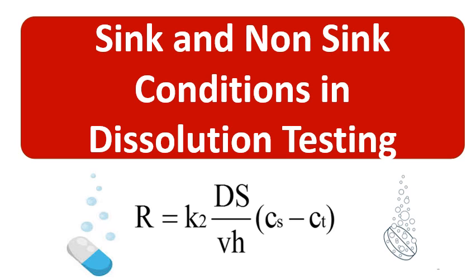And in this present video, the sink and non-sink conditions will be studied in detail. In this video, you will get a complete understanding of sink conditions. What are sink conditions? Why are they required? How to achieve the sink conditions? And what if the sink condition is not achieved, or it is not practical to achieve it? What are the justifications required to prove the dissolution testing under non-sink conditions?